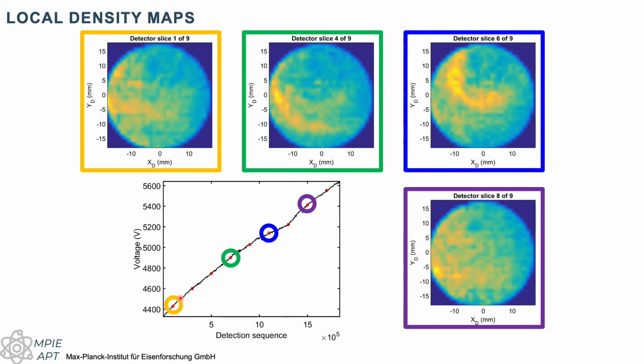The microstructural features typically affect the field evaporation behavior, so we could see more multiples at a grain boundary, for example. And here we see also that there is a dense region corresponding to an interface. And here we went from one grain to the other grain, and the position of the pole is actually almost the same because there is an orientation relationship between the two phases. You can see the pole, the interface is shrinking, and finally the other pole.